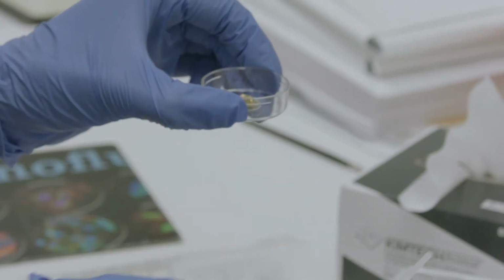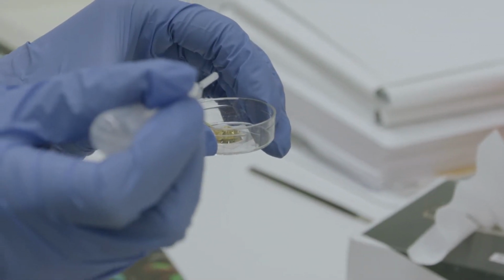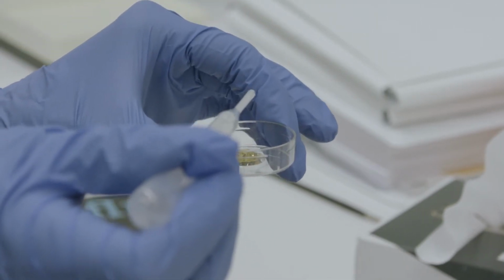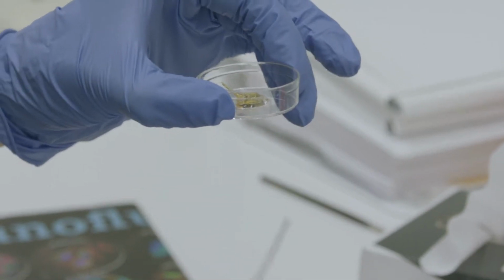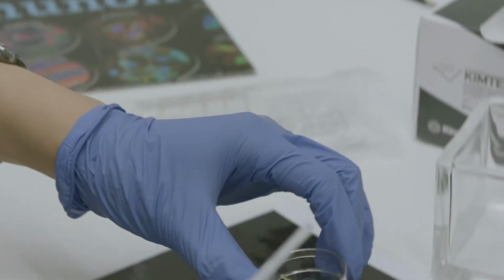Okay. How much, just a few drops? Yeah, a few drops, because in this case the brain is quite big. So you cannot really cover it completely, because otherwise you will melt the plastic around. But if you're interested in imaging the cortex, then this is absolutely fine. And then you just go like this to the microscope. I will show you later.